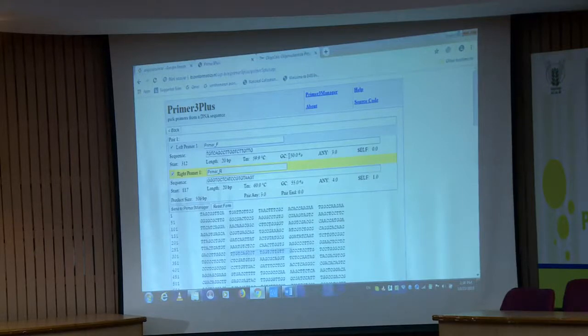This is the length of the primer, this is the TM of that and this is the GC content of this, correct. Whenever we are blasting some sequence in NCBI, whatever hit is the perfect one, it gives at the top. Same thing is with this, the first one is actually the best out of all the primers.